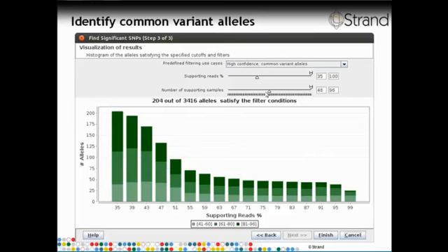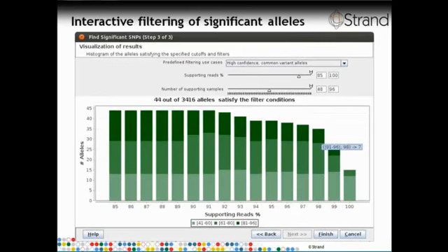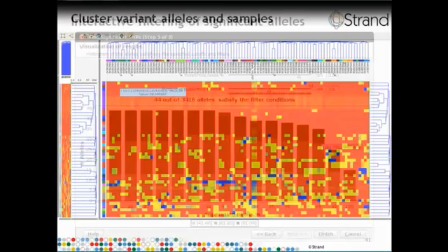Once we are satisfied with the QC, we can try to see if there are any trends about families. Here we have drawn a particular color bar where all the samples of the same family are assigned the same color. We get this information from a spreadsheet which shows for each sample what family it belongs to, and this data was from the 30 trios of European origin.